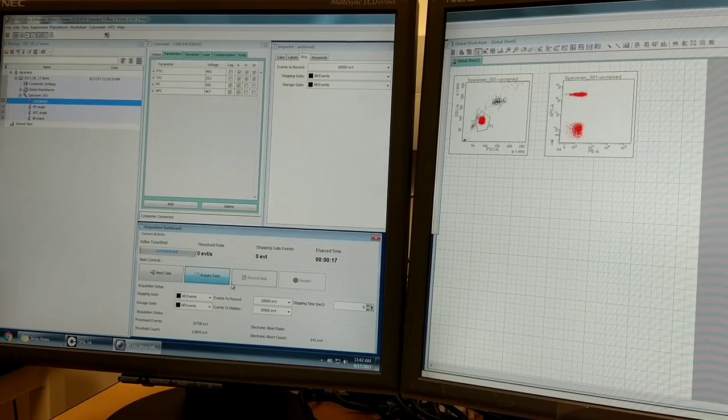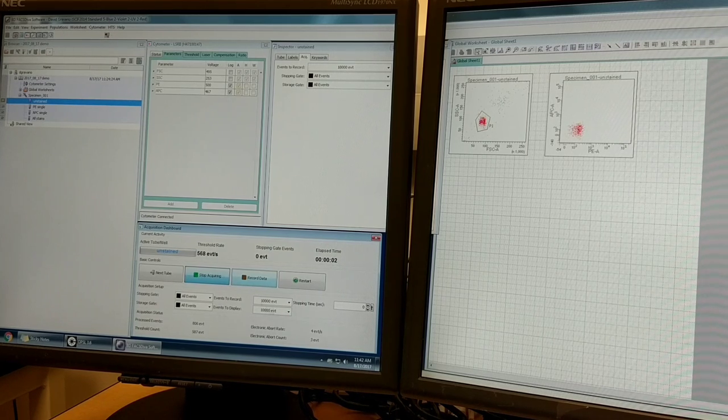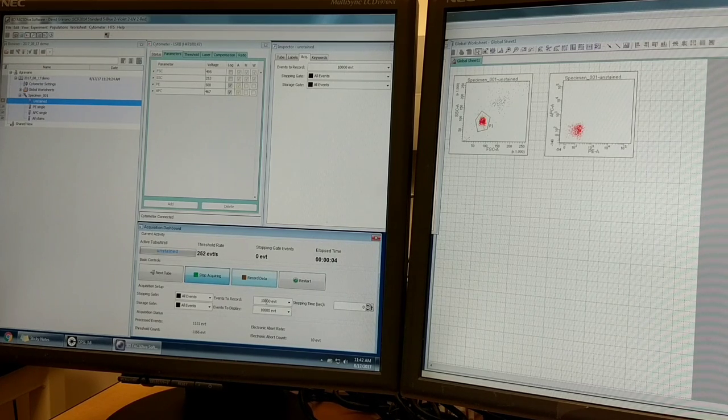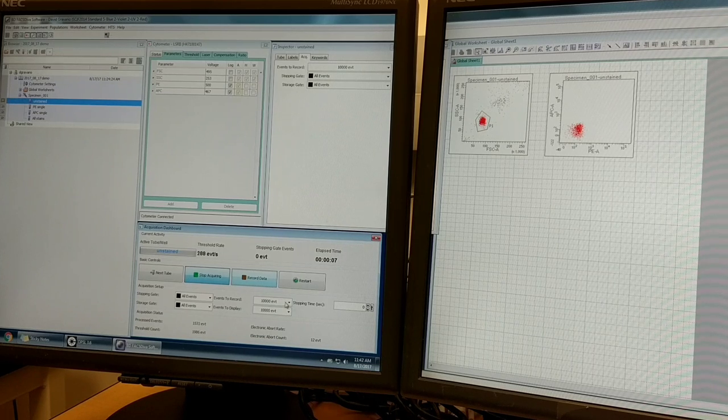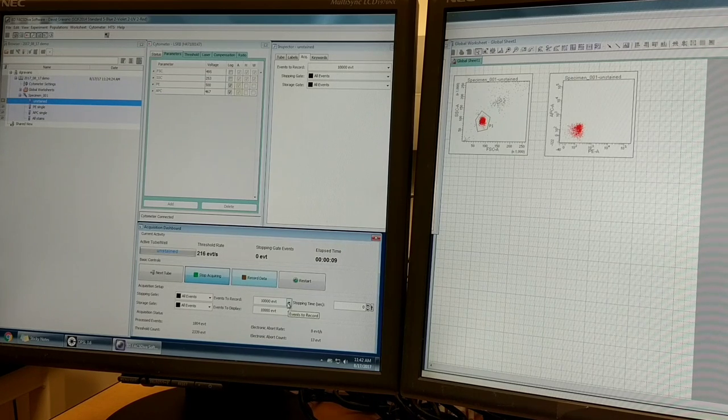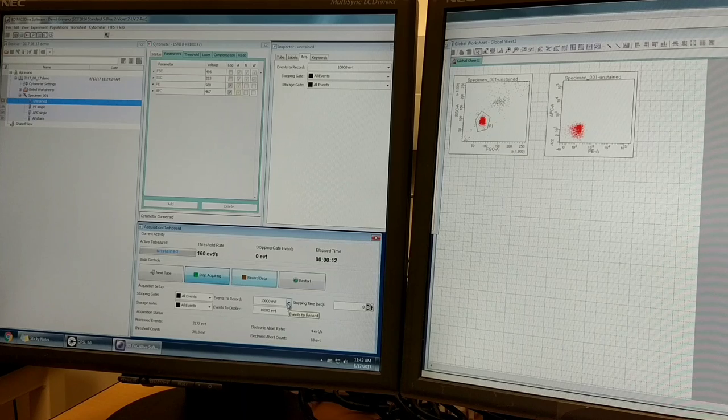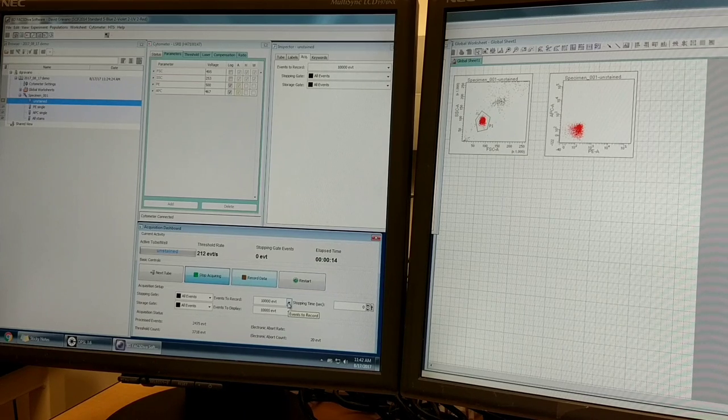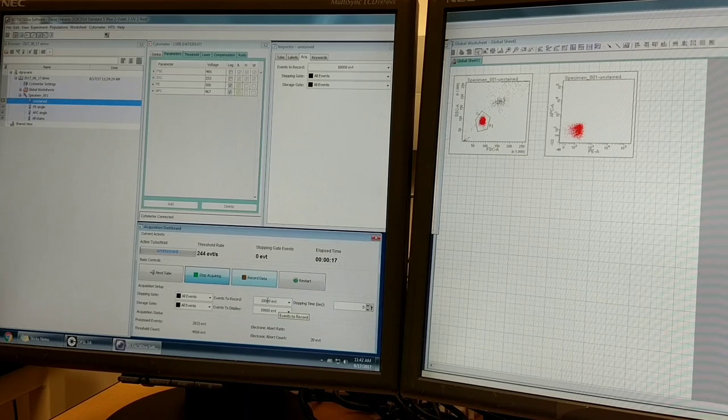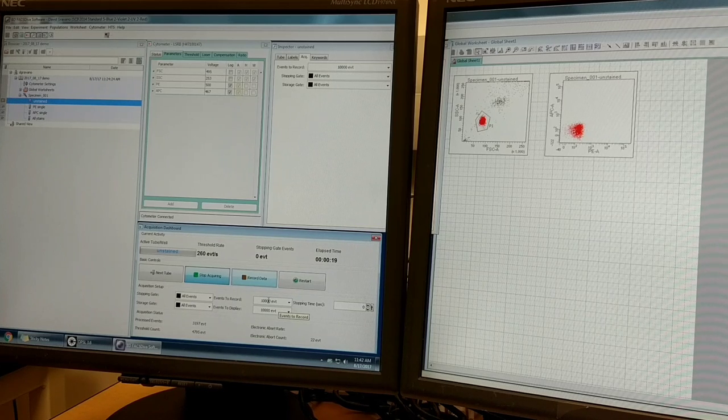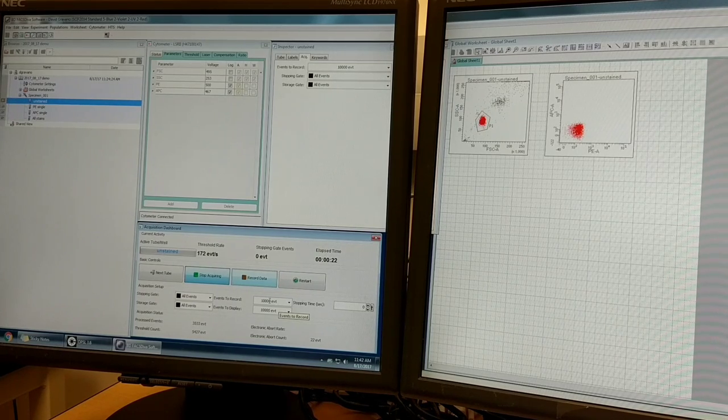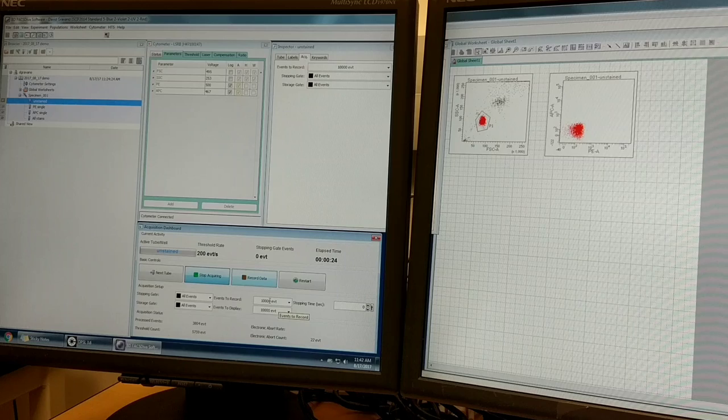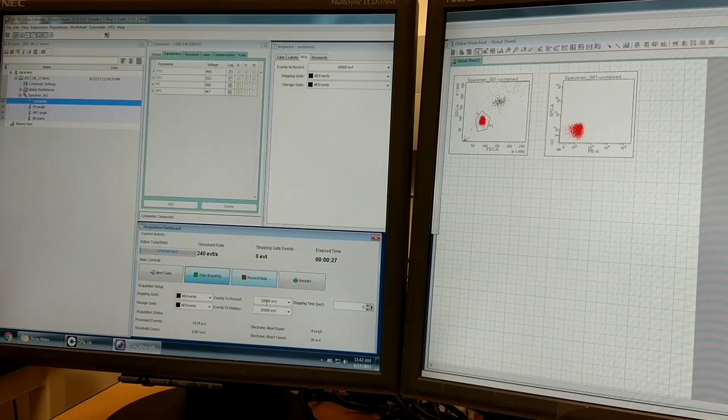Now I'm going to put in my unstained tube. I'm going to press acquire data again. I'm going to tell the machine how many events to record. It's currently set to 10,000. I think that's a fine number for this experiment. You'll want to record more than that, especially if you're trying to identify rare populations of cells. For example, if you have a cell type that's one in 10,000, as stem cells commonly are, you're going to need to record a lot more than 10,000 events. Otherwise you'd only see one stem cell in all your data set.